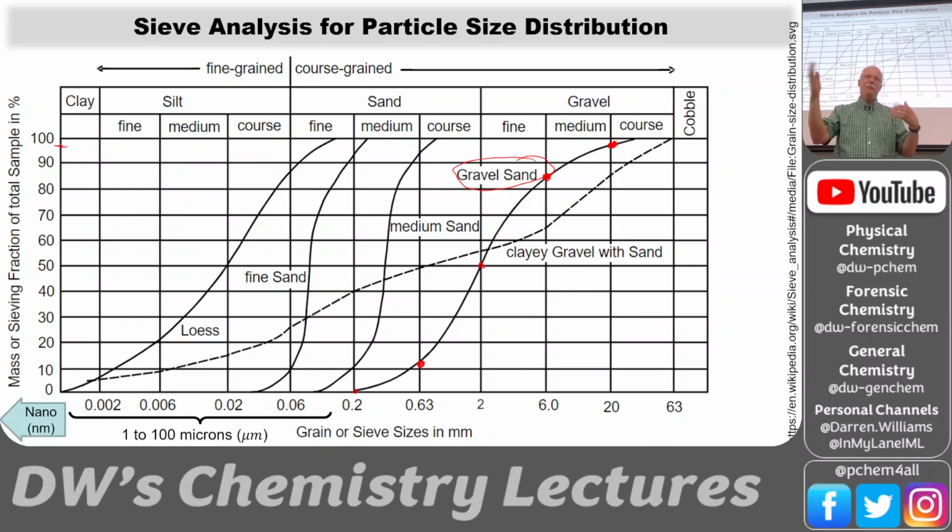You know, we weren't getting 100% or something was missing. And we thought, man, is our sieve leaking? Is it spilling out? What's going on? We looked at the equipment. And so the only way to diagnose something like that is what they call walk the line. It's like a production line. If you're a manager, you go walk the line and say, show me how you do this analysis.